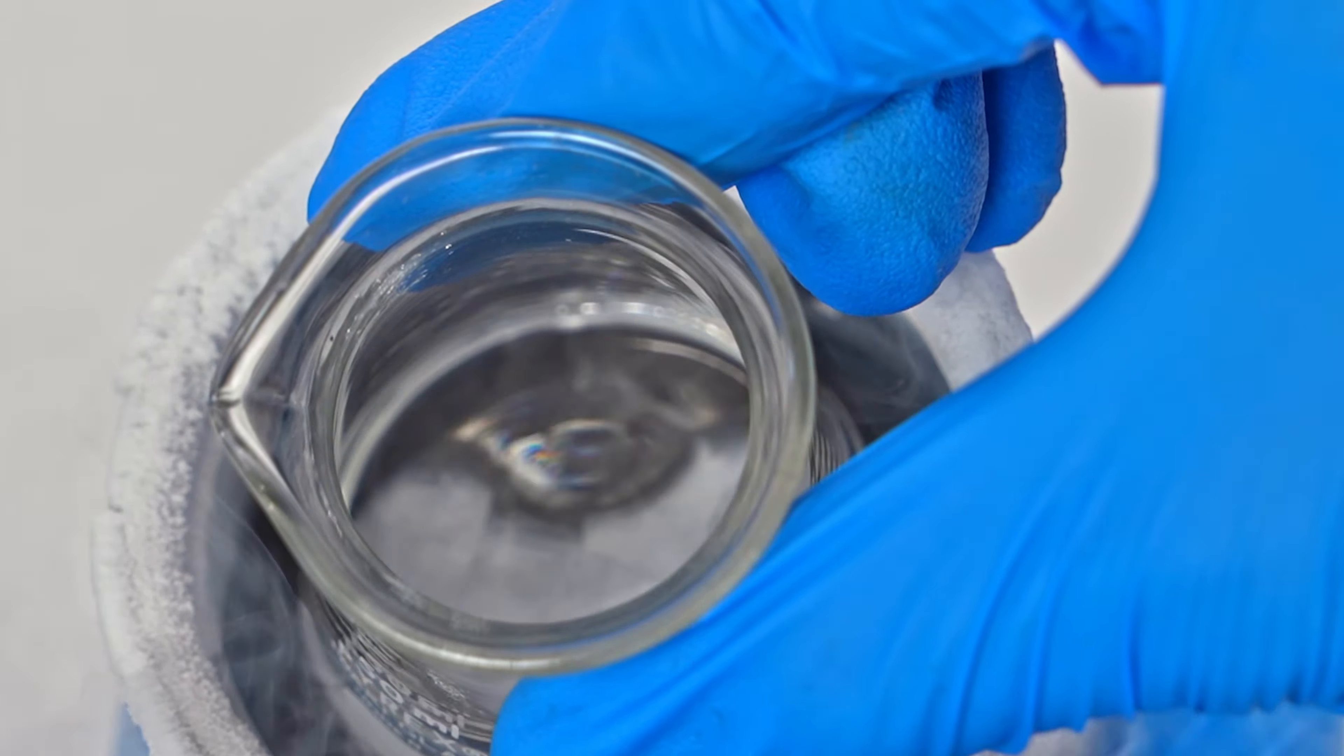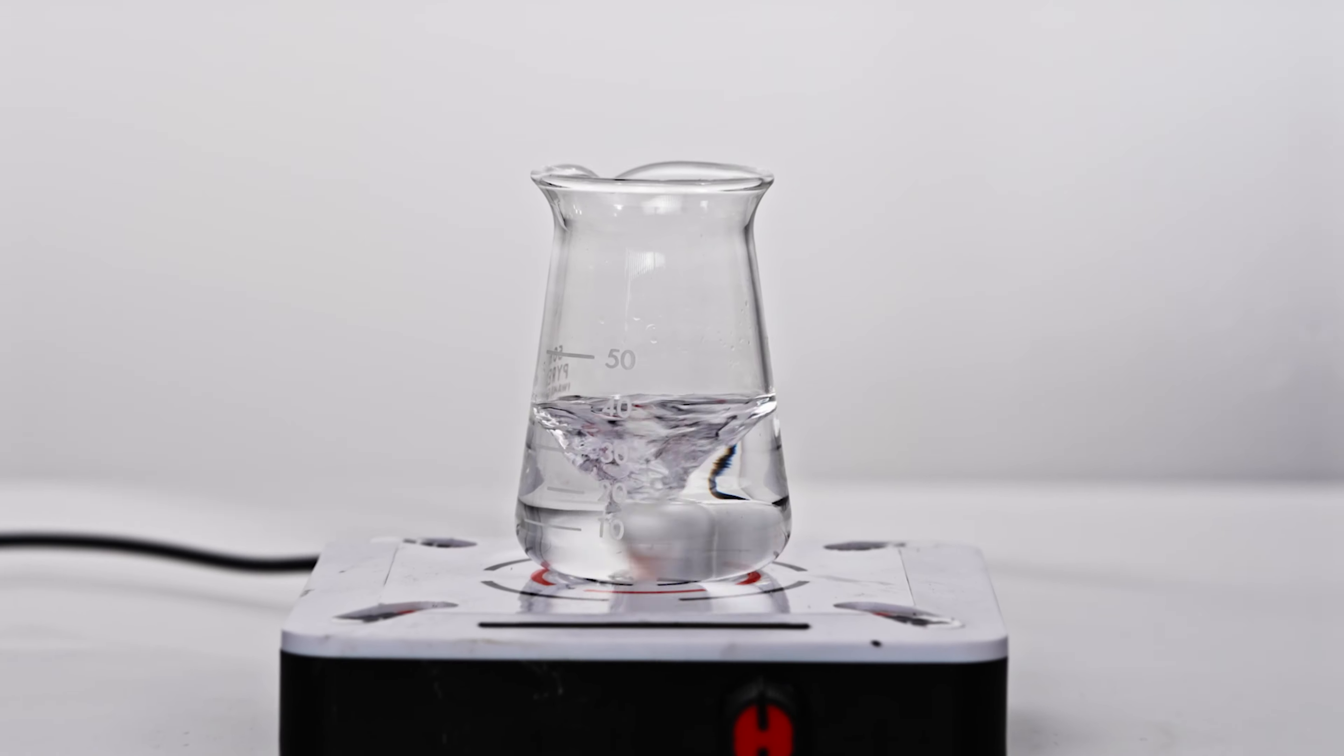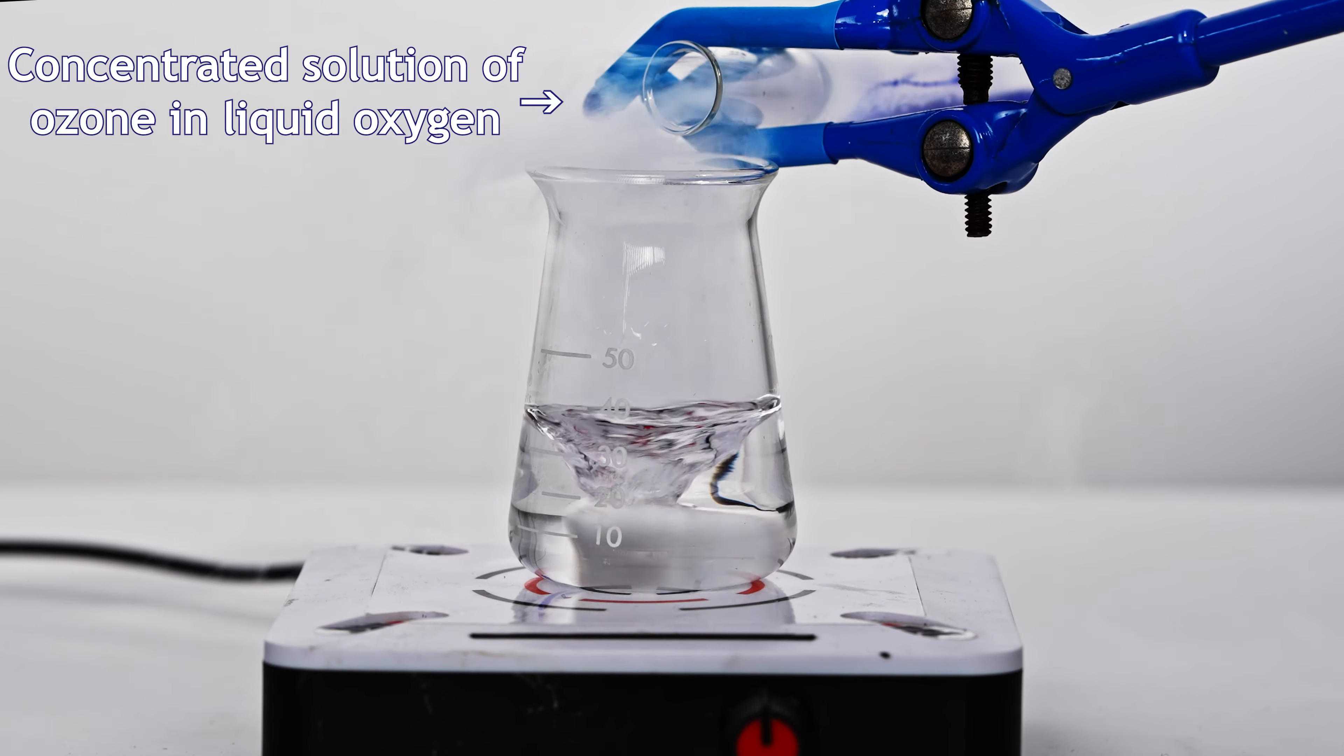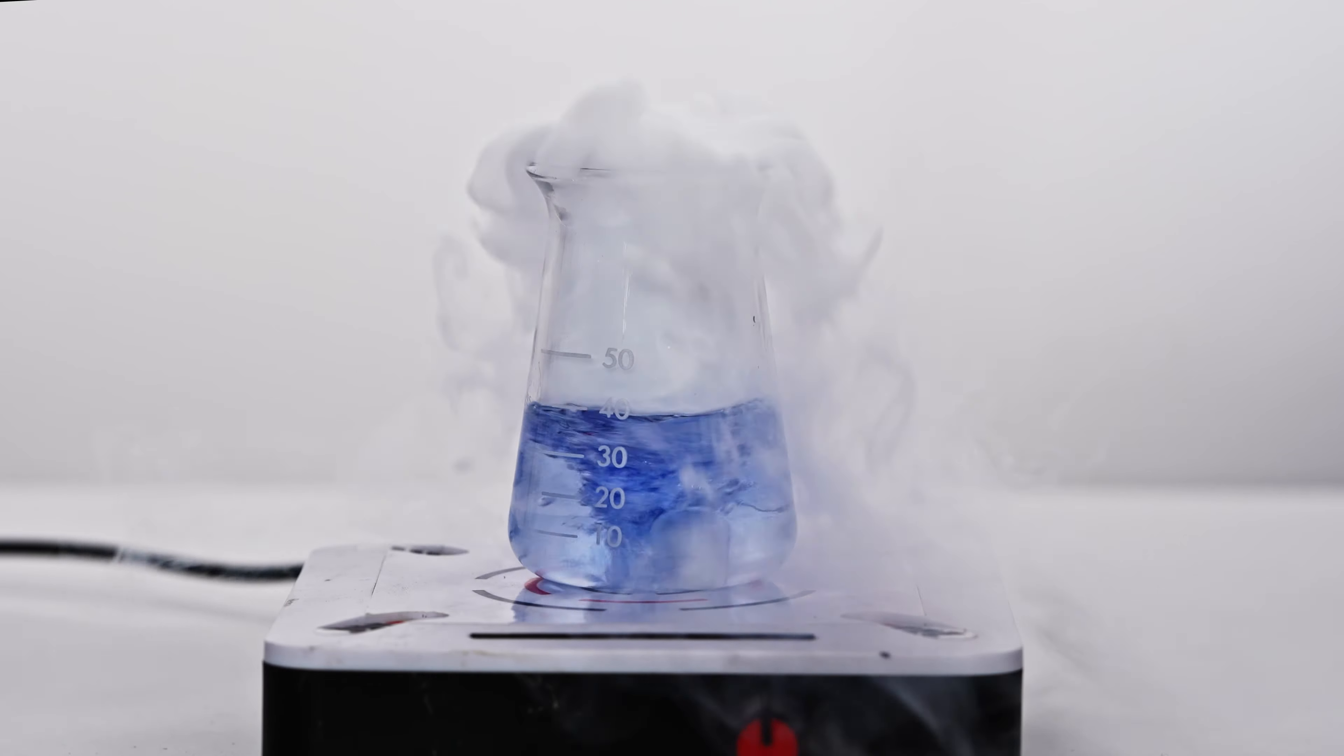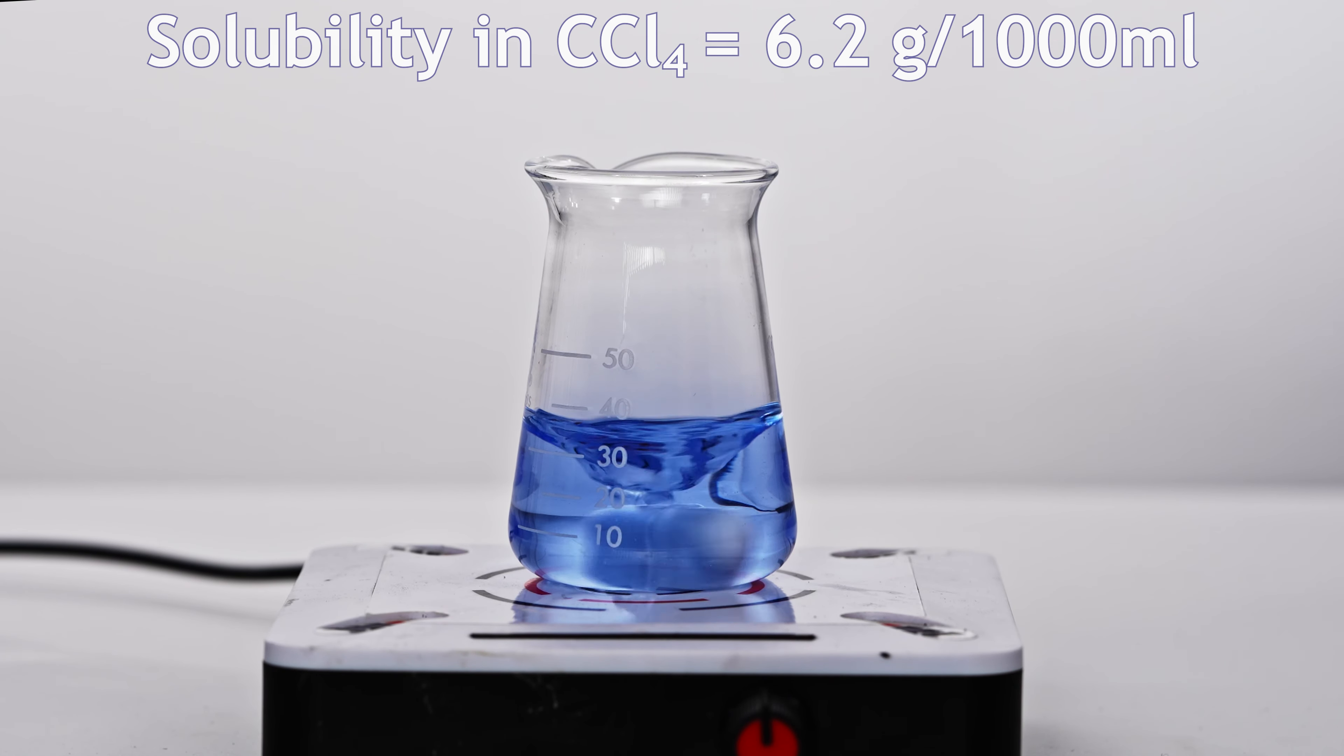To achieve this, I cooled the beaker of tetrachloromethane, and while stirring, I added a concentrated ozone solution in oxygen. Ozone's solubility in tetrachloromethane is a little over 6 grams per 1 liter of solvent. As it dissolves, the solution turns blue, with the intensity depending on the ozone concentration.